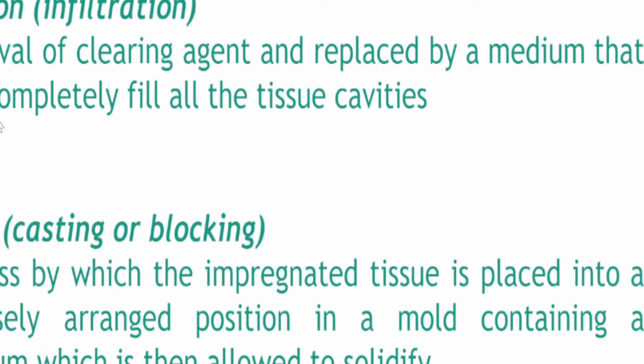Bakit? Kasi doon nila malalaman, inilagay ni Dr. Canlas na sa harap yung lumen. Dapat pagka in-embed ko siya, nasa harap pa rin yung lumen. Okay? Yung tumor, itatalikod ko para hindi makita yung tumor, para walang cancer. Ganon. 'Di ba? Hindi pwedeng ganon, ha, class? Wag ganon. Baka mamaya itago ninyo yung tumor.